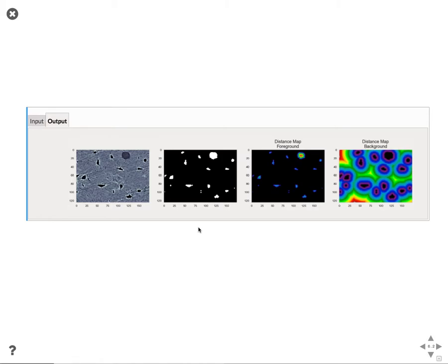So we start off with this example that we had before, where we have these holes in the bone. These make up cells. And we're able to calculate the threshold, the distance map, the thickness maps as we've done last time, but there's still a lot we haven't really characterized in this sample. How can we extract some of those pieces of information?